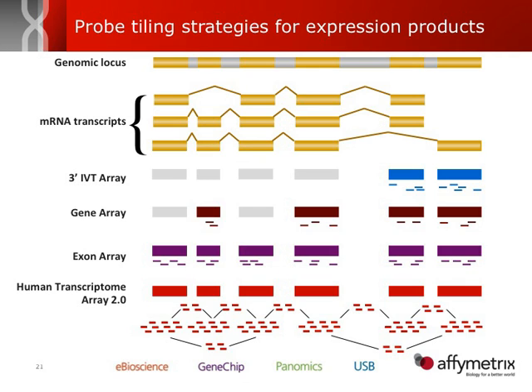So these right down here are the probe sets that are interrogating the junction between exon 1 and exon 2. We'd expect no signal from those probe sets, and also we'd expect no signal from the probe set that interrogates the junction between exon 2 and exon 3. So there are 2 more pieces of evidence.